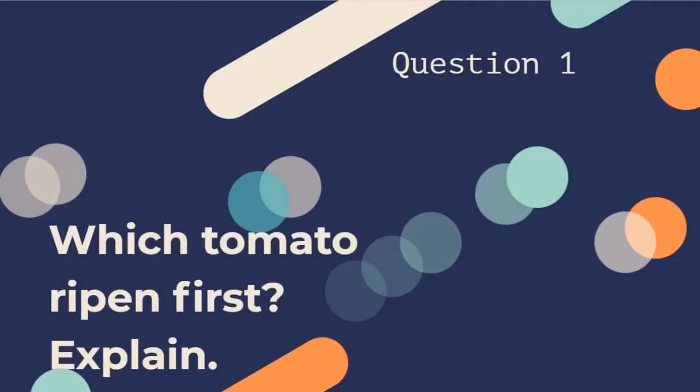So now that we've done the experiment and also obtained results, we can answer the questions in the discussion section. If you want to attempt the questions yourself, then you can pause this video at any given time and answer the questions before I give the answer.